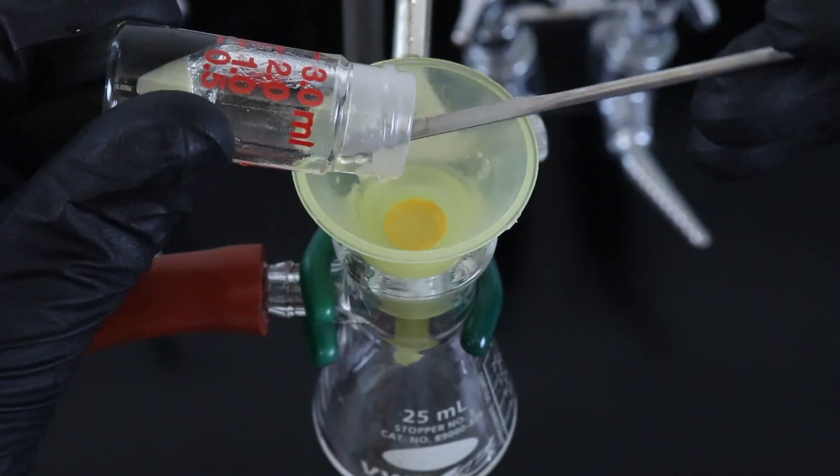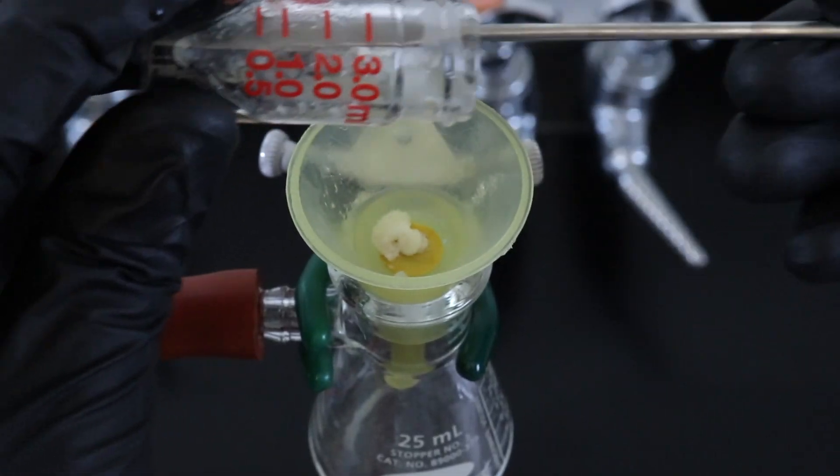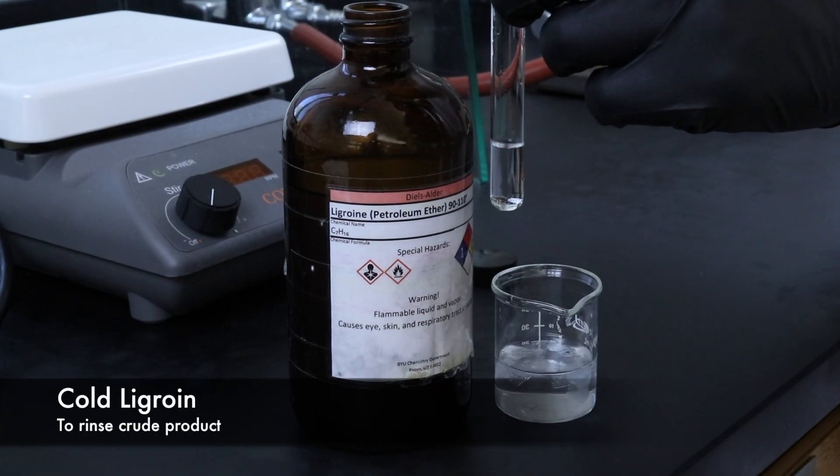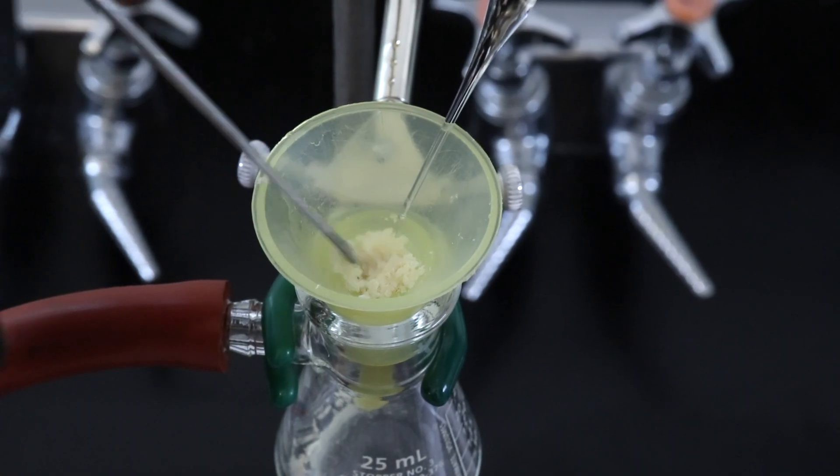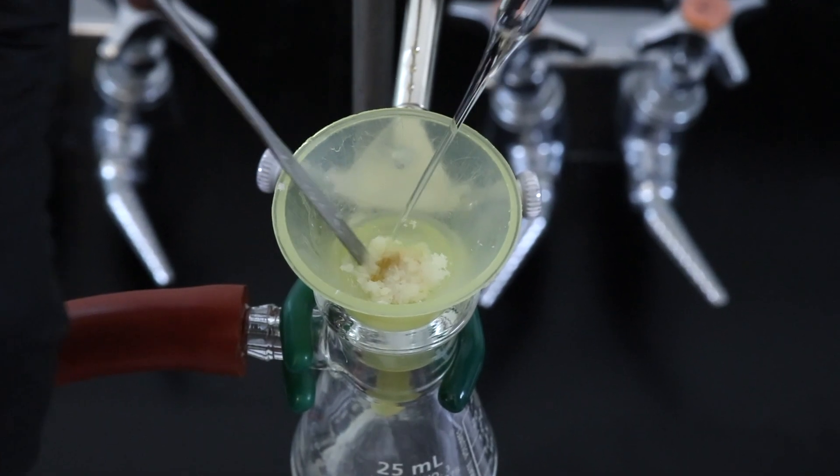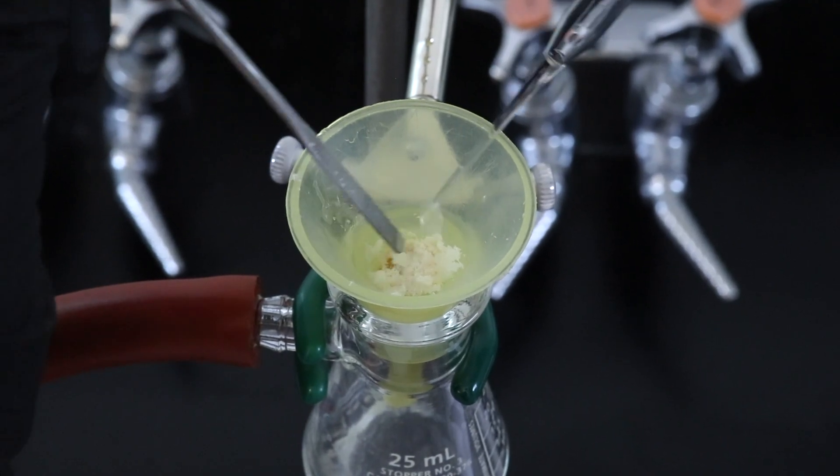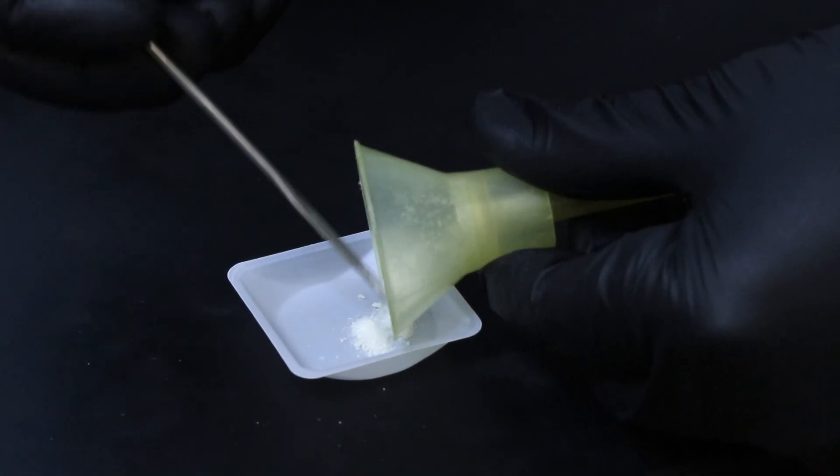Then the crystals can be isolated using a Hirsch funnel and vacuum filtration. Then I'll be using some cold ligroin to rinse the contents of the conical vial and also rinse the product on the Hirsch funnel. And I'll go ahead and rinse it a couple times.